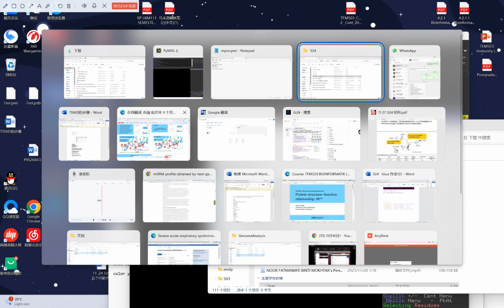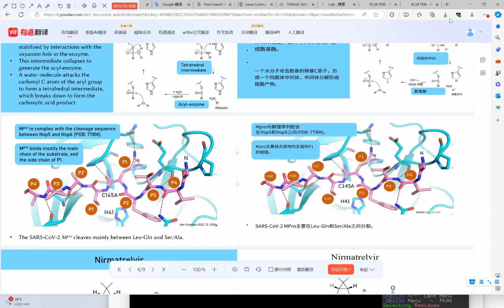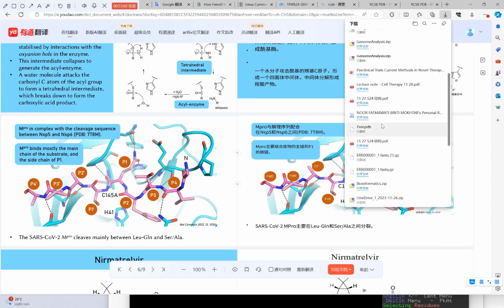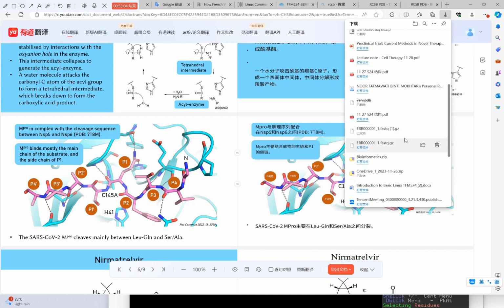Oh. Okay, now okay. Show cartoon. Show, not shown. You can see usually there must be a star.